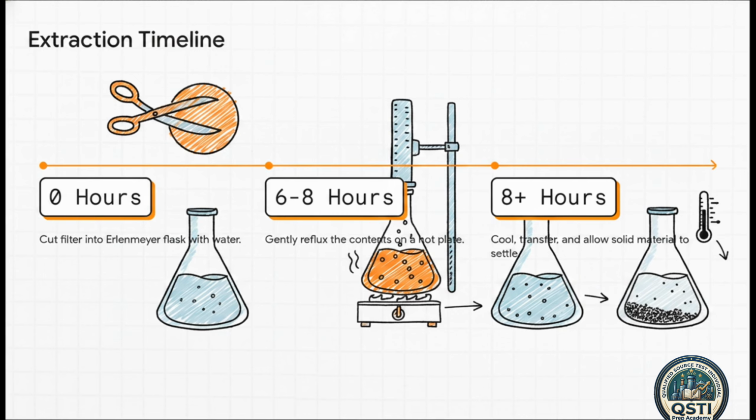This 6 to 8 hour boiling cycle is absolutely vital. I mean, it's essentially a full workday spent watching water boil, but it ensures every single microscopic bit of the collected sample is dissolved and pulled completely out of the filter fibers. Only after 8 long hours can we finally cool it down and let the solid materials settle to the bottom.